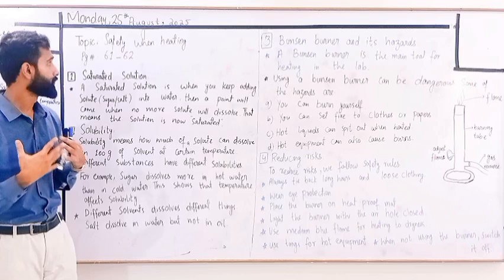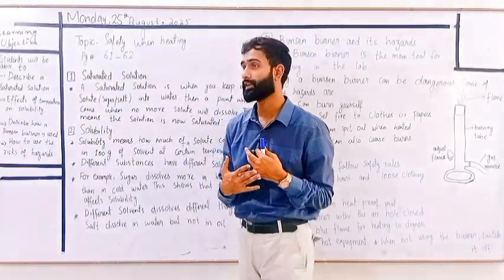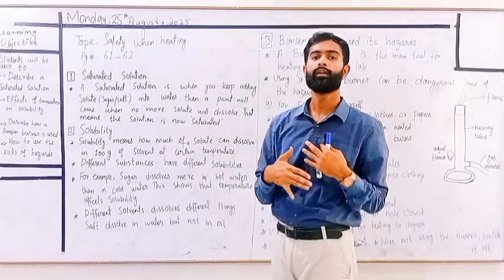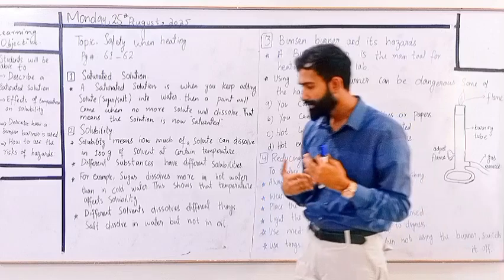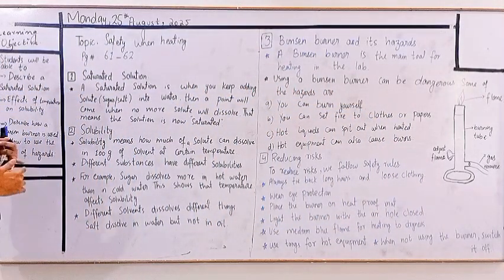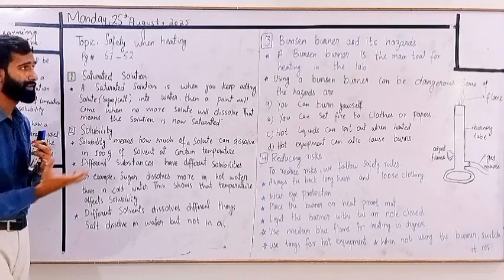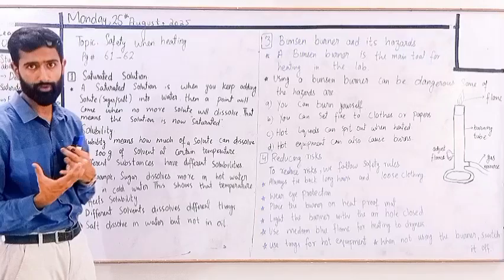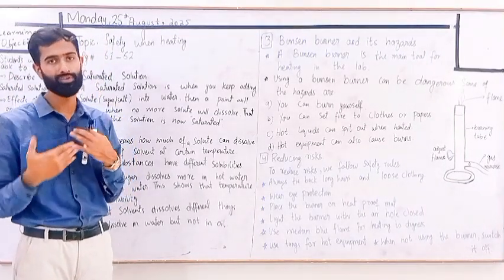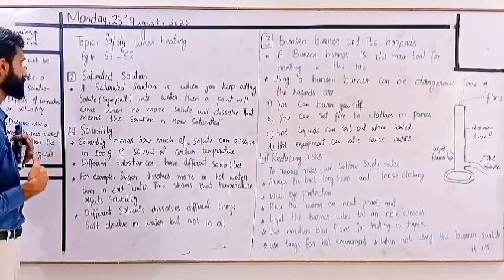Today we are going to discuss a very important science idea that is related to safety when heating in labs. Why is safety important during heating experiments? We will also discuss saturated solutions, solubility, what Bunsen burners are, some hazards of Bunsen burners, and some ways to reduce the risk of using a Bunsen burner in experiments. So without wasting any more time, let's get started.